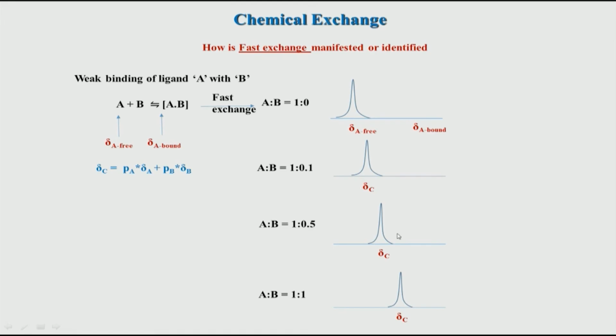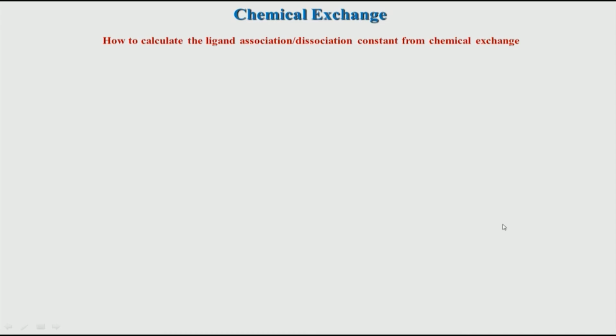So, therefore, looking at this kind of peak structure, the moving of the peaks as I am adding B is a very simple and strong indicator that fast exchange is going on in my sample, and you can say that the ligand is weakly binding, and because of the weak binding nature it is having a fast exchange compared to the chemical shift difference. So, this peak shifts because the population of B increases. Now, based on these two processes, we have looked at slow and fast exchange.